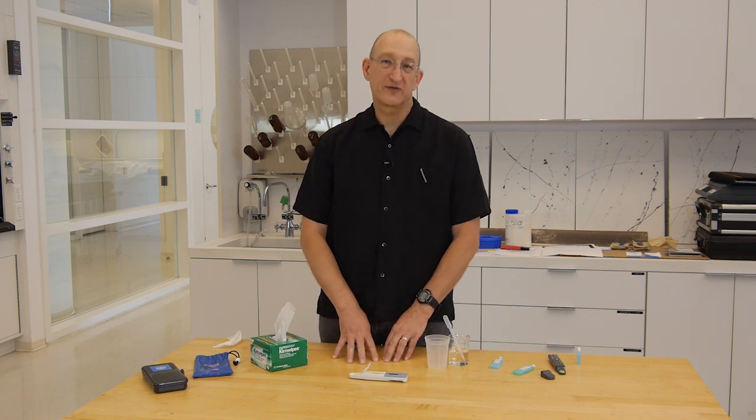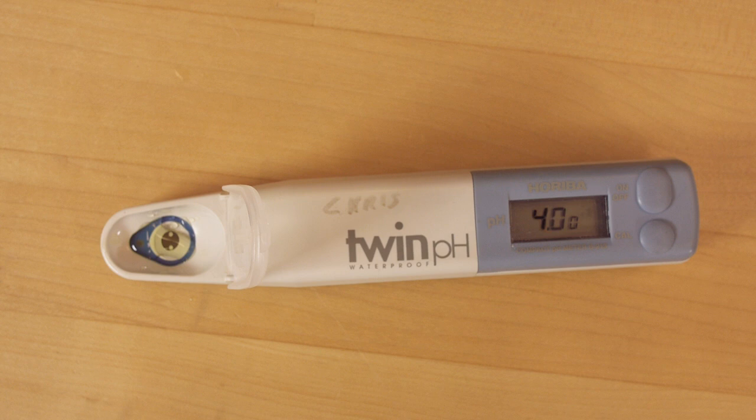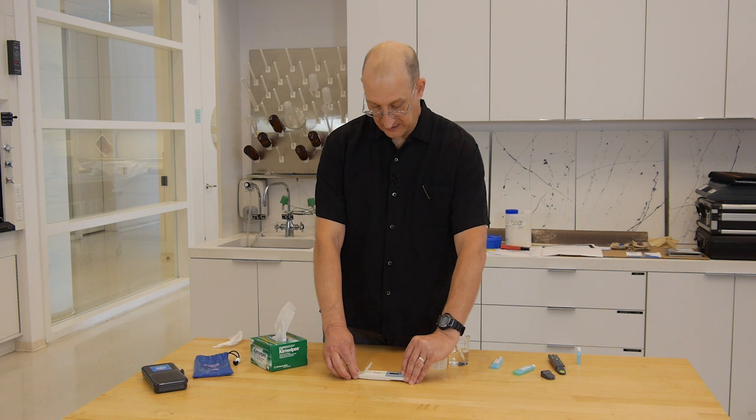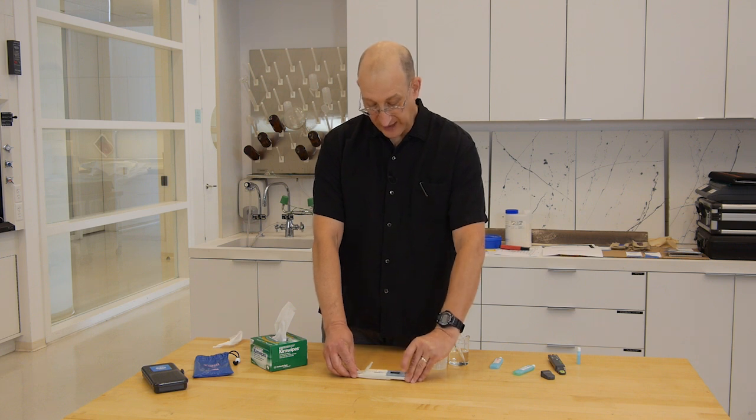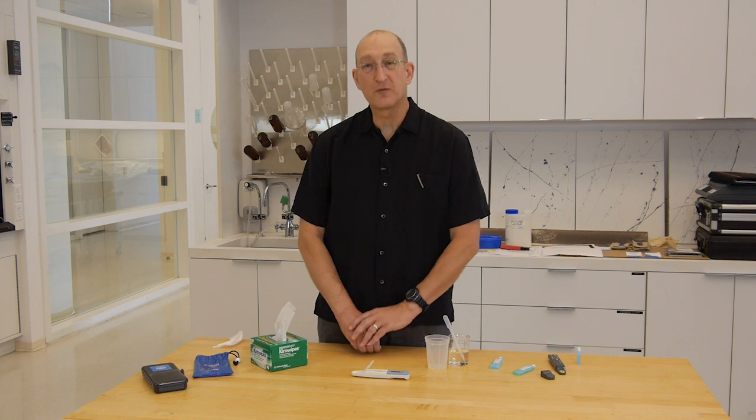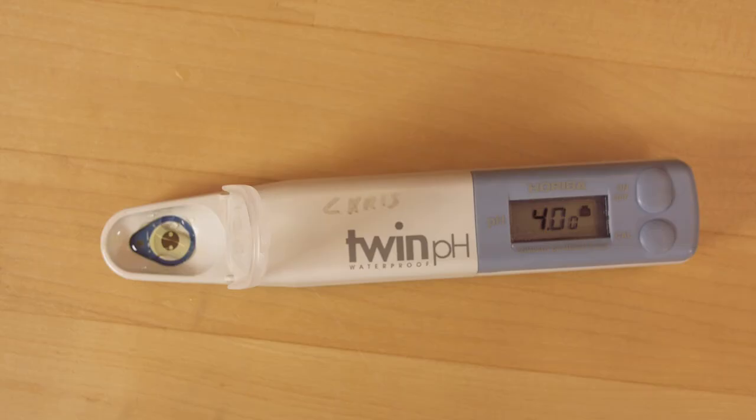Again, we wait for the happy face. We have our happy face, so we push the calibrate button. Initially it wants to calibrate to pH 7. We don't want that. We push again, and we're now calibrating to pH 4. If we were calibrating to 10, we would push one more time, and we would get the calibration for 10. We wait again for the happy face.